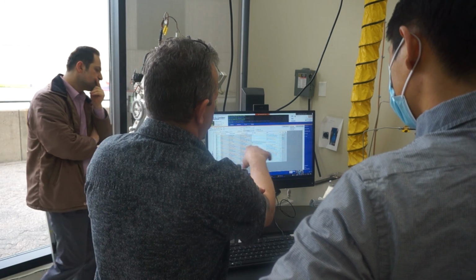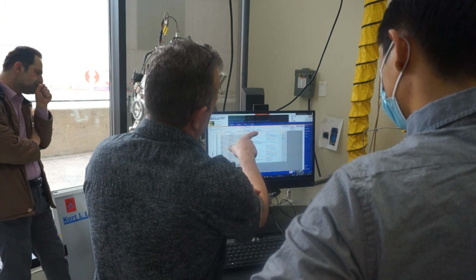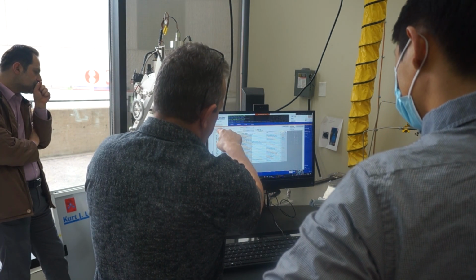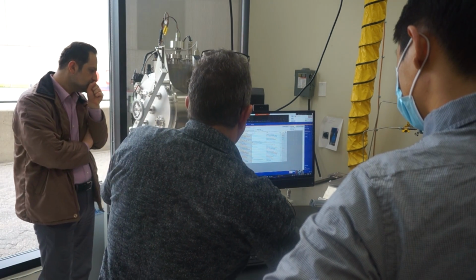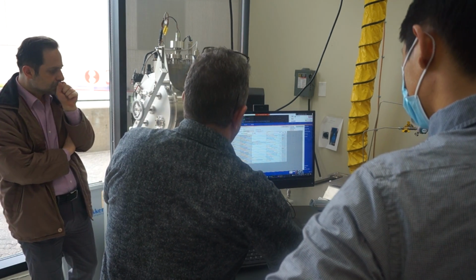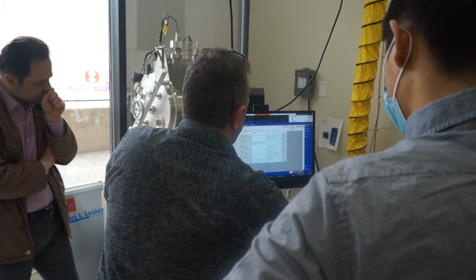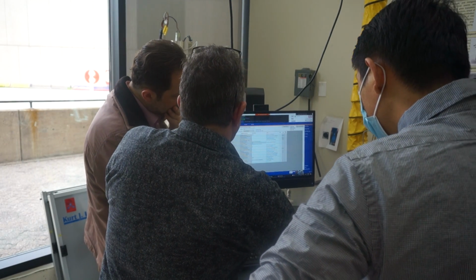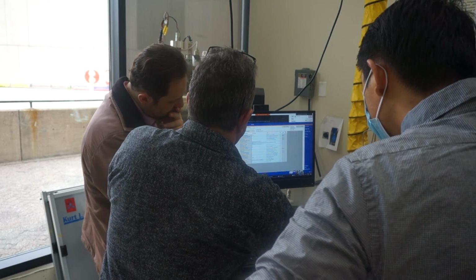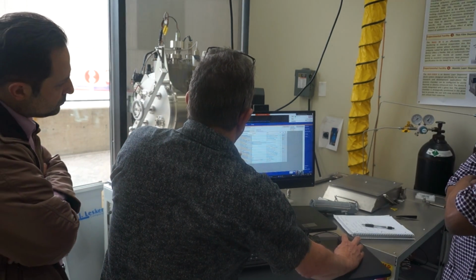The recipe for the AB recipe, meaning TMA and H2O pairs, is similar as far as lines to the PC pump and PC vent recipe, but what is different is the sub-recipes. The first step just changes your scan; it sets your scan interval at 1 second.